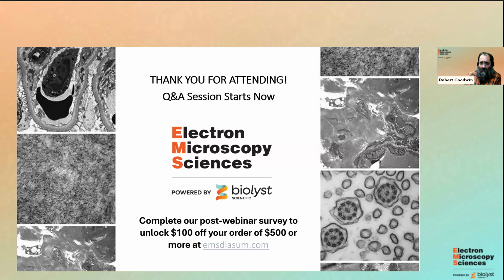On the research side, there are some protocols where we do still use it. I don't handle much of the research stuff, but it is something that comes up now and then. I think it was like 0.03 grams in 1 mL, so it was a very small amount. But yes, and also in certain cases you can add tannic acid to your buffer stage to increase some contrast as well.